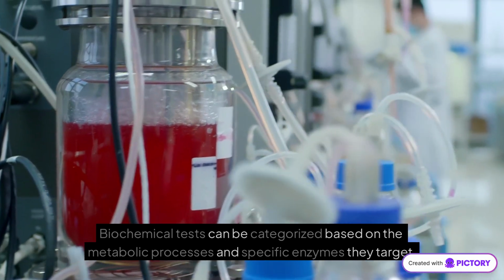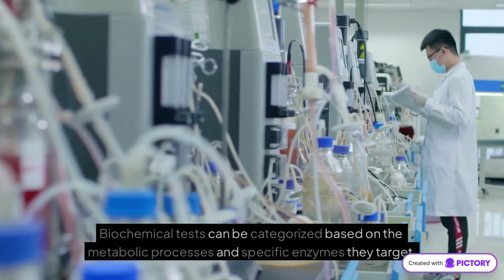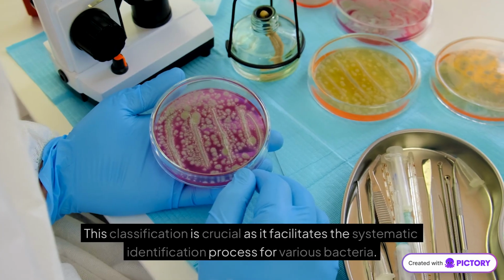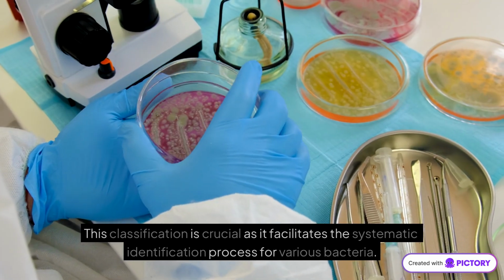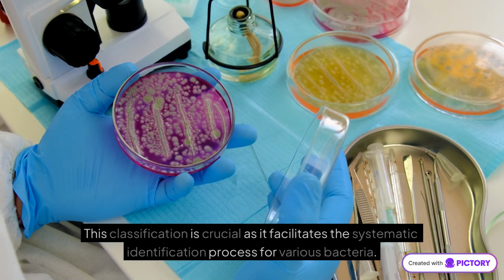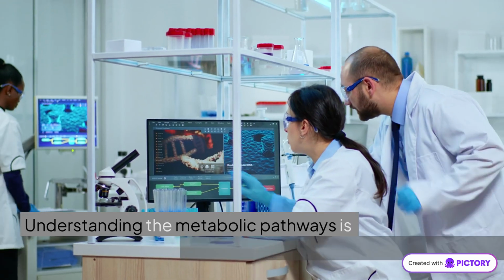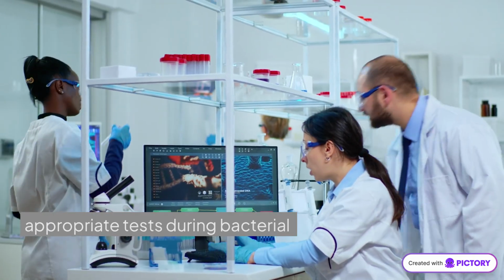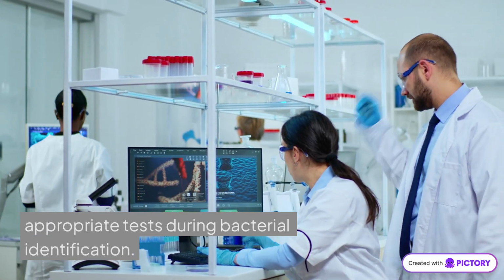Biochemical tests can be categorized based on the metabolic processes and specific enzymes they target. This classification is crucial as it facilitates the systematic identification process for various bacteria. Understanding the metabolic pathways is essential for microbiologists to select the appropriate tests during bacterial identification.